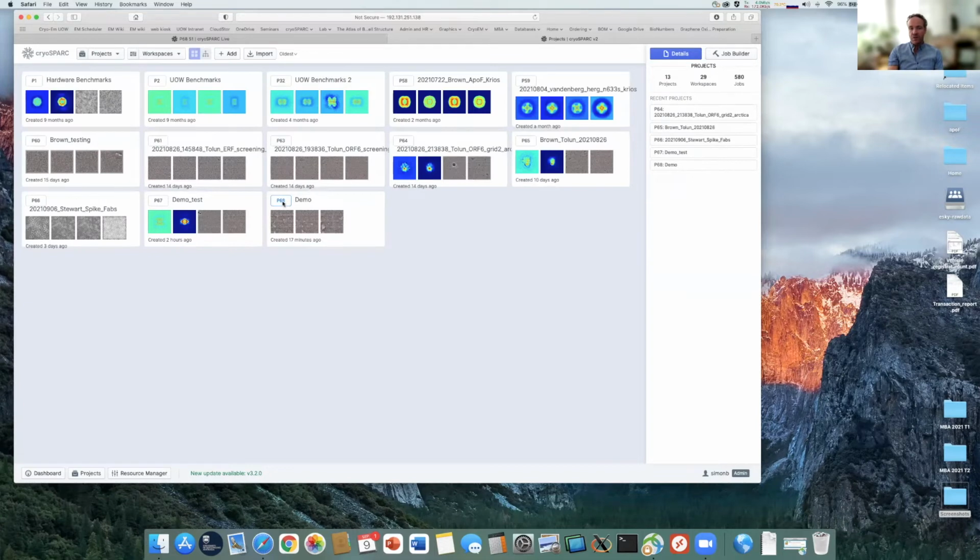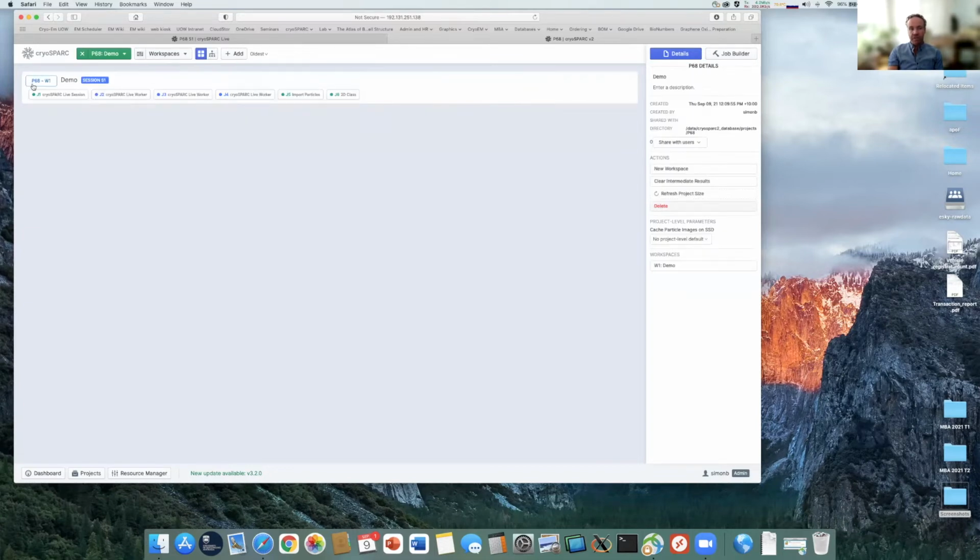So I can just send this whole project, project 68, that directory, down to Massive, and then that can be imported in, and people can access it that way. And all the bits and bobs that are needed are included in that project, except for the movies from the file server. So they're separate. That's the junction between the two.